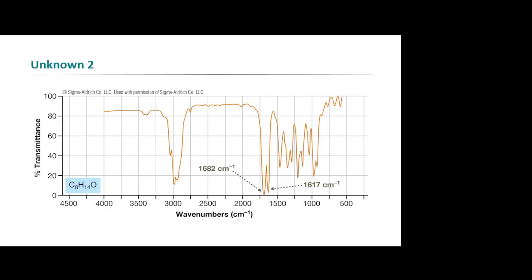Oh, wait. What are you looking at? Looking at the absorption frequency. Okay. And I look here. What exactly are you looking at? The alkene C=C is between 1620, yes. I didn't hear your lower range. Okay. All right.